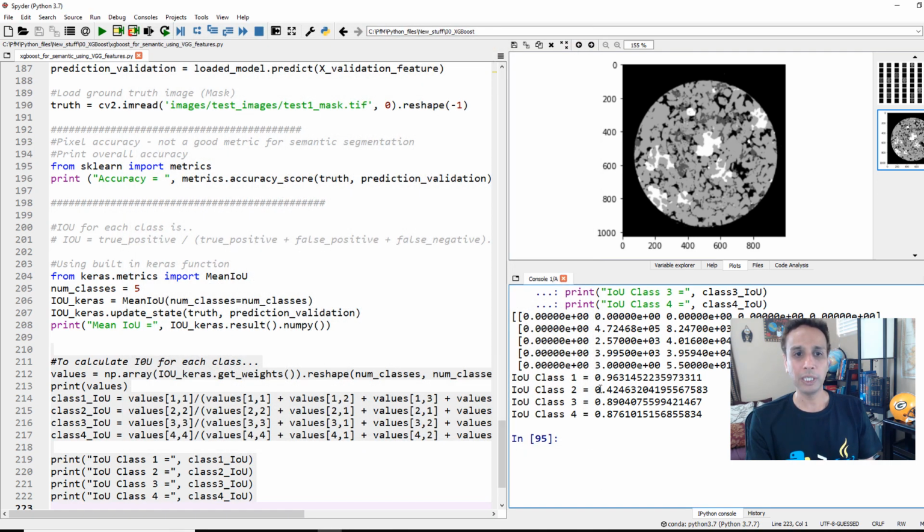But if you do deep learning, I've done exactly the same thing on deep learning. I've done random forest. In fact, with Keras, I actually got like this accuracy in like 30s or so. So this is actually doing much better than anything else. This 42% is not a failure of XGBoost. It just reflects the complexity of segmentation for this specific sample. If I get much more training data, that definitely improves, especially if I balance that against all the other regions.